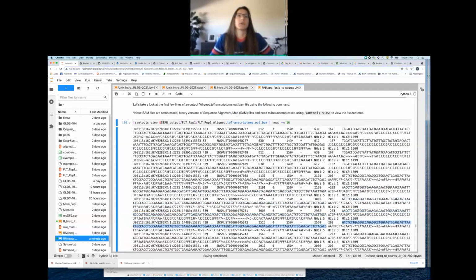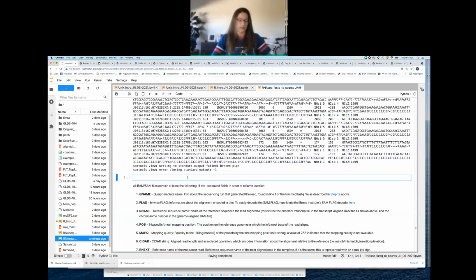And then let's add a code block. I'm going to do the end of my script first, just because I copied that and I want to copy something else. So end it with a pipe, and then just put that there for now. And if you guys want to easily get to the start of your command, you see how my cursor here is at the end?